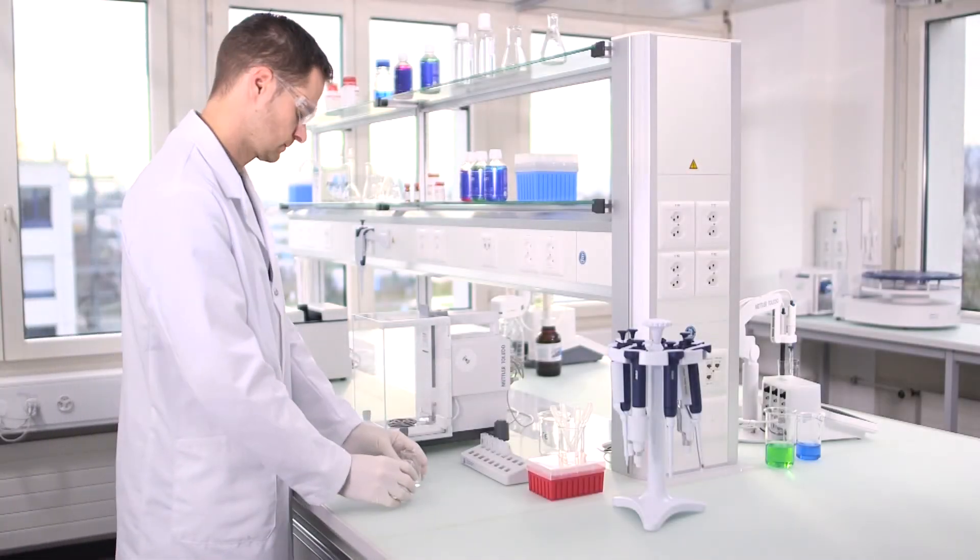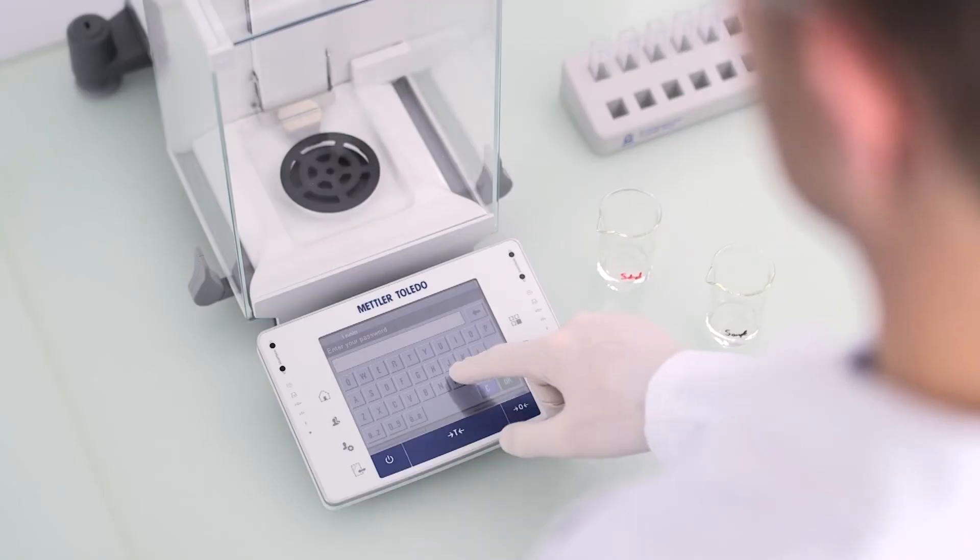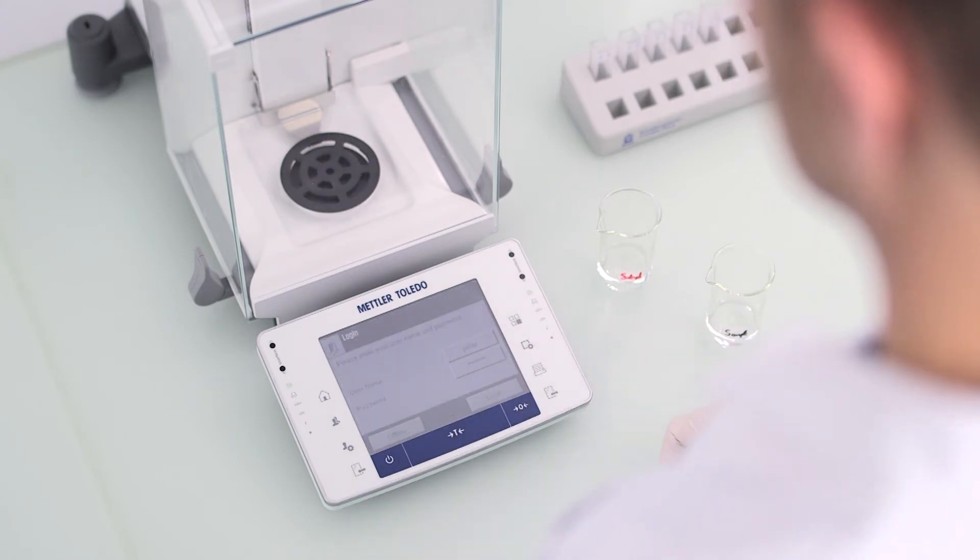To ensure data integrity with LabX, controls can be put into place to ensure SOPs are followed. Calculation and transcription errors are removed and the technician is given the necessary tools.